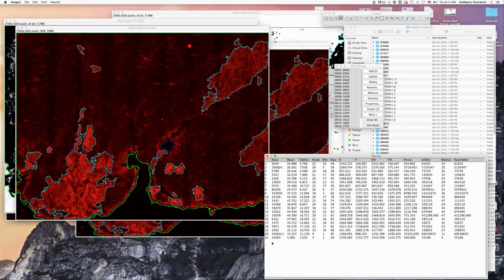Alright, so now you can see we have 21 areas of differing areas, which are particularly what we're interested in. This bottom one is sort of the outside total, and then this is one we're going to exclude from the total. And so we'll have to make a document of how that works in just a moment, and we'll discuss that.